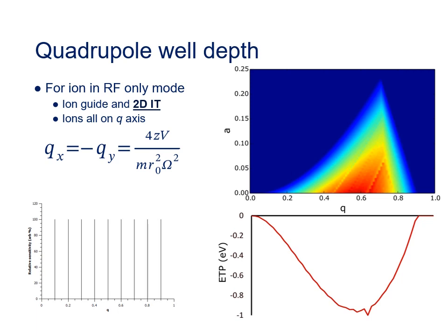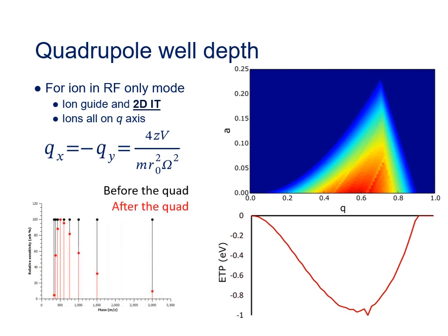So that may mean you see the most sensitivity for ions that had a Q of 0.6, but much less sensitivity for ions of higher and lower values of Q, like this. Now remember, Q is inversely proportional to the mass-to-charge ratio, so we can convert this Q value to the underlying mass-to-charge ratio values. And this biasing effect on the ion intensities is solely a function of the fact that the ion beam has passed through a quadrupole component.